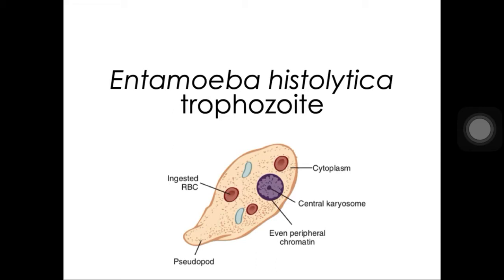So I also have there an illustration that you can compare with the images presented a while ago. So for the Entamoeba histolytica, this one is the only pathogenic amoeba, as we know, and this one is commonly associated with intestinal amoebiasis or amoebic colitis, as well as amoebic dysentery. Ano po yung difference ng amoebic colitis, amoebic dysentery?